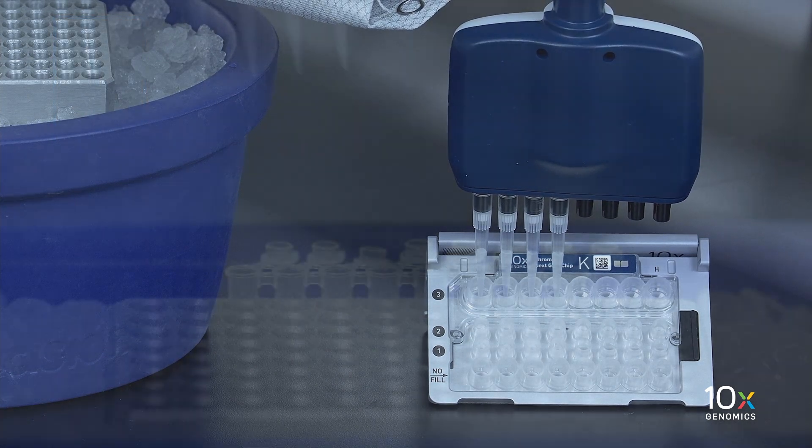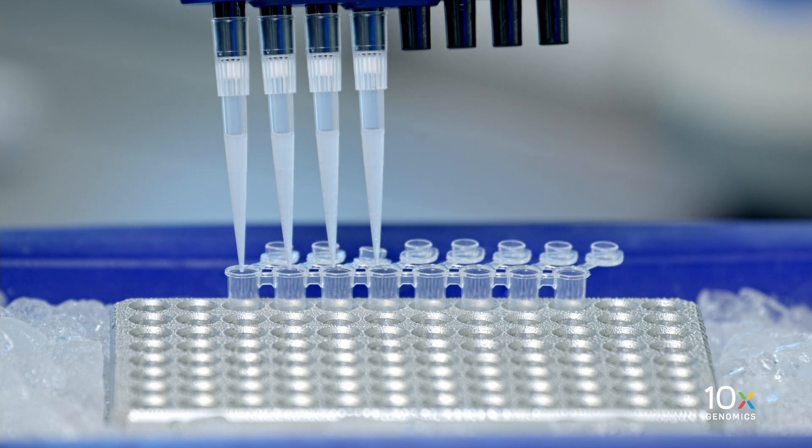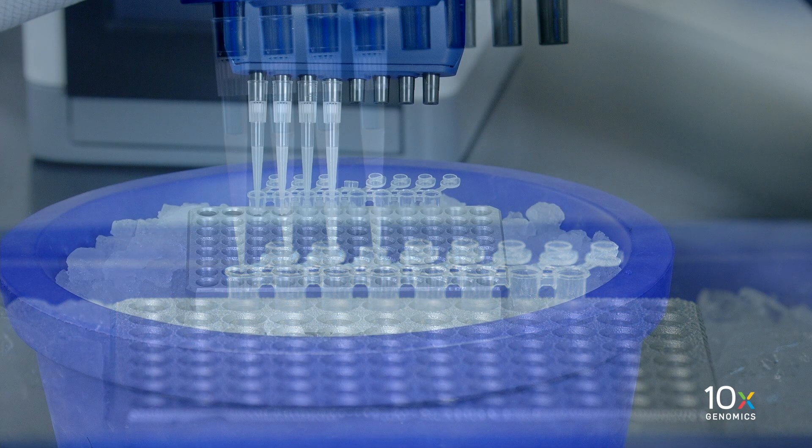Withdraw the pipette tips from the wells. Gems should appear opaque and uniform across all channels. Over the course of approximately 20 seconds, dispense the gems into the tube strip on ice with the pipette tips against the sidewalls of the tubes.